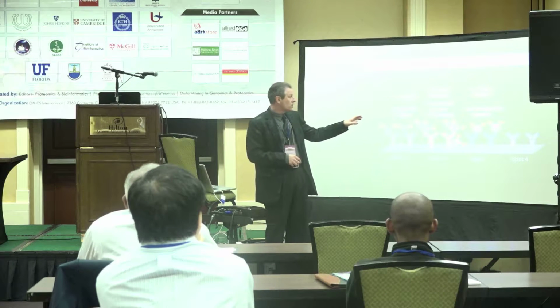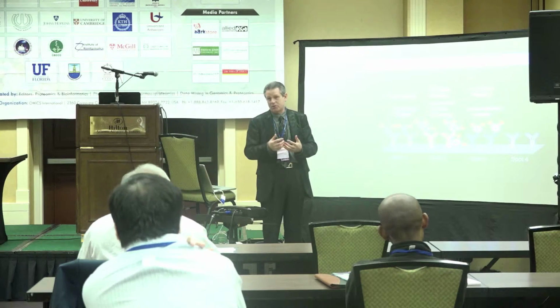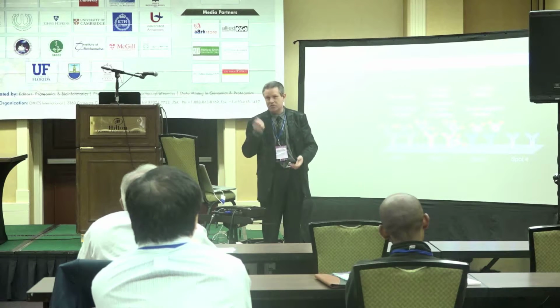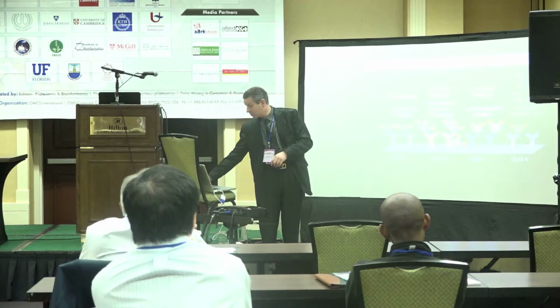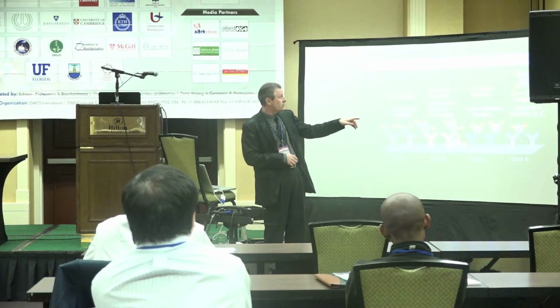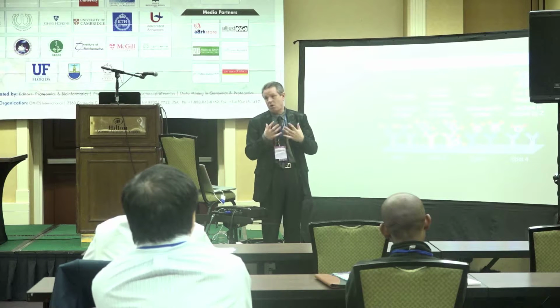The other thing is that you can often have a cross-reactive protein, something that shares an epitope or is very similar enough that at high concentration this protein will now bind. So you get false positives that way. And then you'll also get false negatives if the epitope that's involved in the interaction is binding another protein and it's blocked from binding. So these are all issues with antibody microarrays.